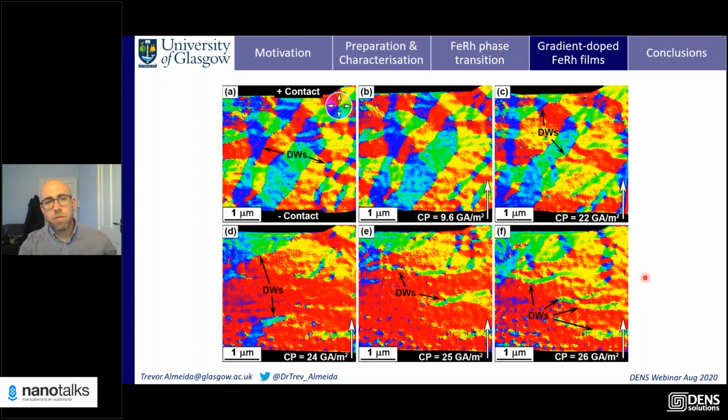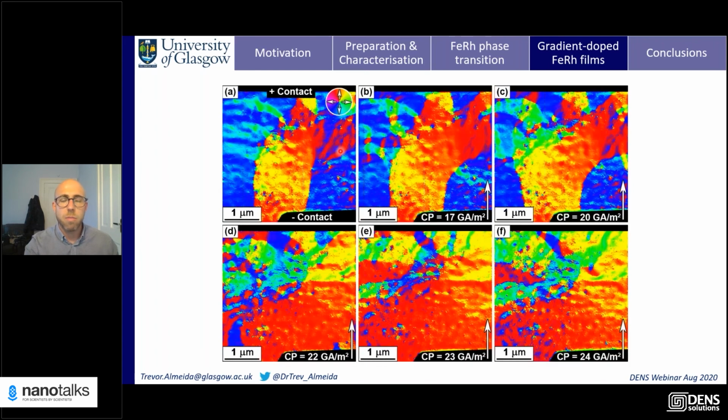So this initial state was how the sample looked when we put it in under magnetic-field-free conditions. And then once we apply these current pulses, it becomes a state where they tend to lie perpendicular to the current pulse. So then to try and get rid of that, again, we saturate it in one direction. And as I showed with the quantitative measurements of saturation induction, we try and get these states where these magnetic domain walls are parallel by applying the objective lens and tilting the sample. And then we can apply, again, increasing levels of voltage or current density into the sample. We can see how these domain walls essentially become more perpendicular to the current pulse direction.